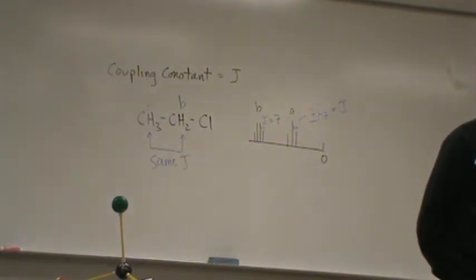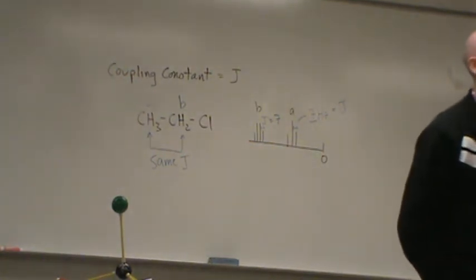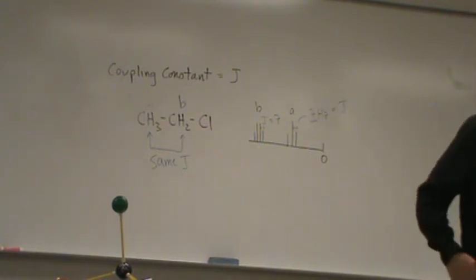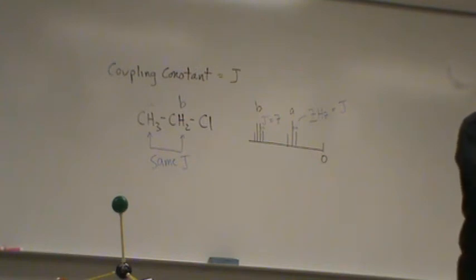Yeah, I'd give it to you. But in reality, you would measure them. Used to be the way you measure them is you pulled out a ruler and measured it. But now you can do it on the NMR machine. It will give that to you, so it's pretty easy. And so I'll be easy to give it to you as well.